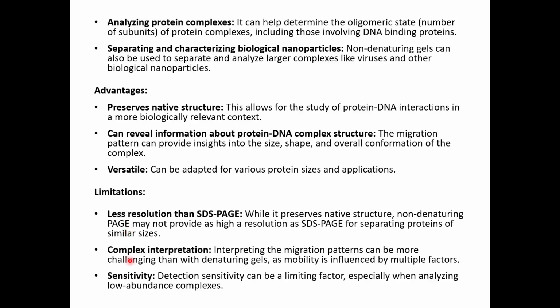And the other is complex interpretation. Interpreting the migratory patterns can be more challenging than with denaturing gels, as the mobility is influenced by multiple factors.